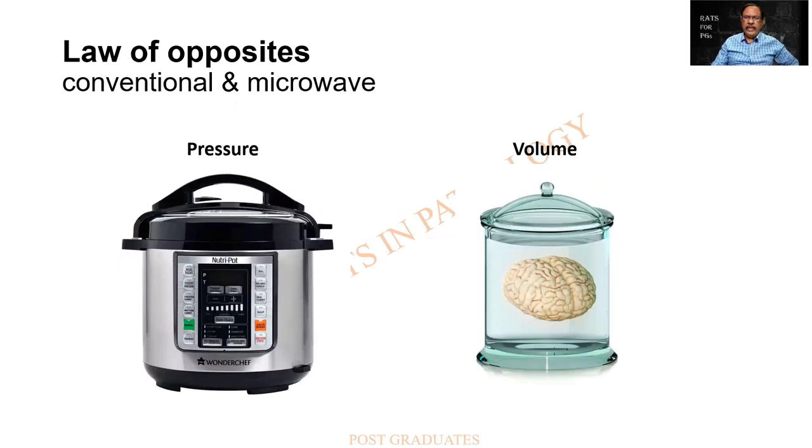For the next few slides, I shall be wandering with some slides with which we shall be trying to find a way to unknown destinations. This is a pressure cooker that is ordinarily used for cooking, in which the cooking is dependent on the amount of pressure that is created.